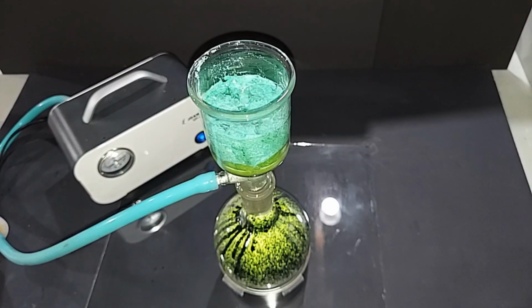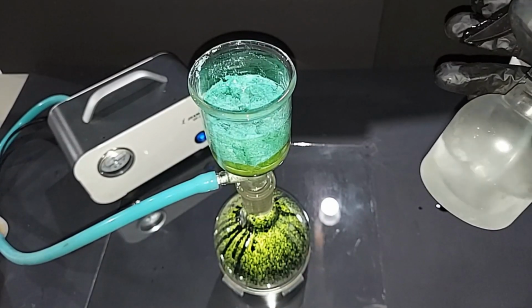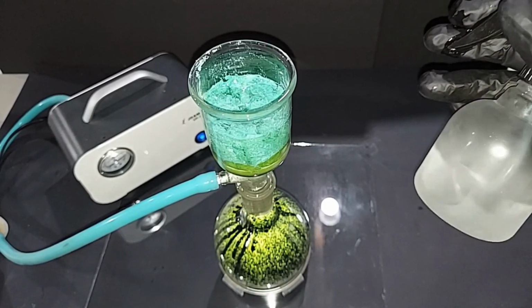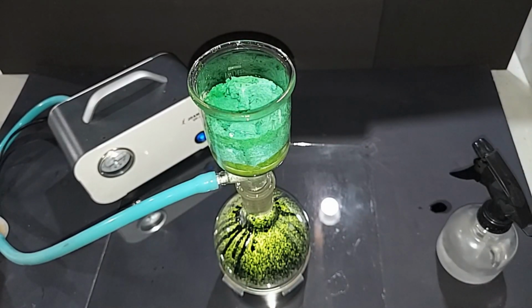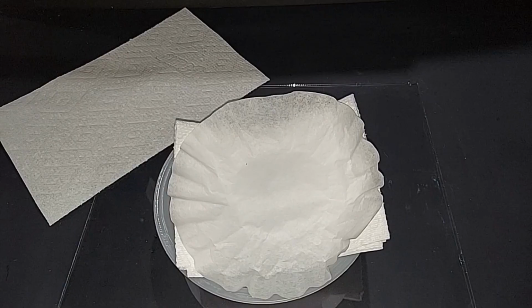So I do want to clean it with some ethanol. I mentioned ethanol or acetone, and this is about 96-97% ethanol, and it was in a freezer that was 15 degrees Celsius below zero, so it's really cold, and you still want to use it sparingly. Okay, that's plenty. I'm going to let that draw through, and then we'll dry it. Okay, that's dried out pretty well. I'm going to turn this off, scoop it out, and air dry it.